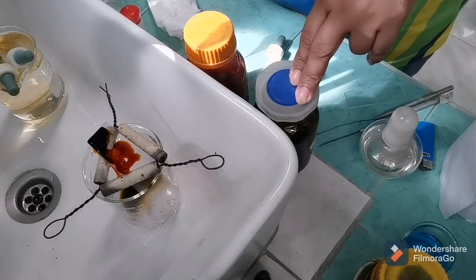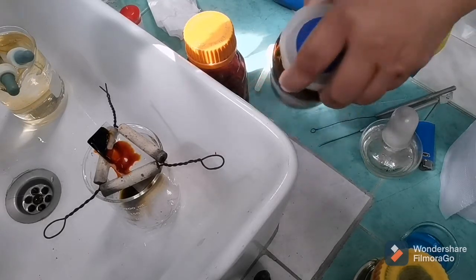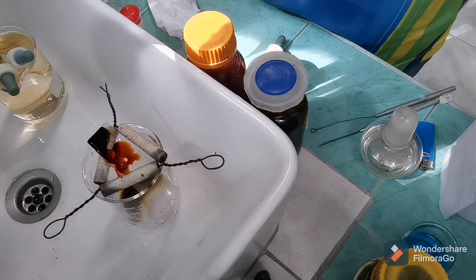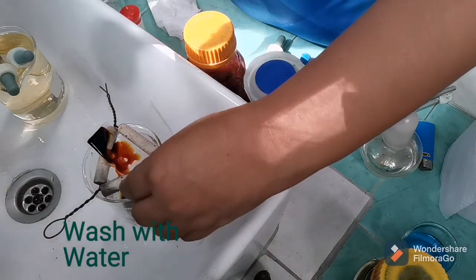And then after that, we will decolorize it with 95% alcohol. So, take note, you are going to wash that first with water.